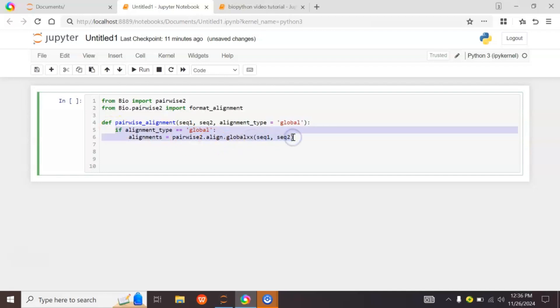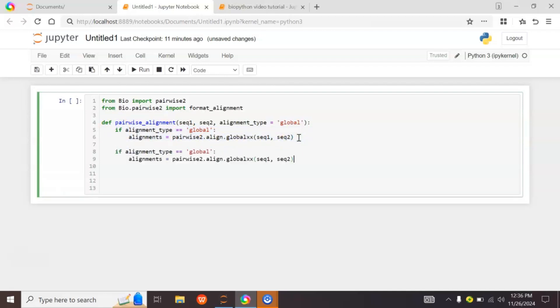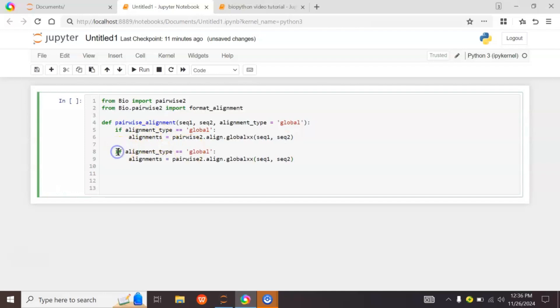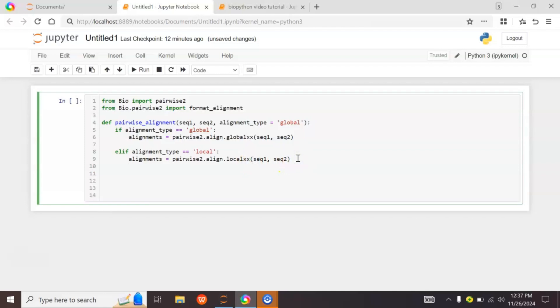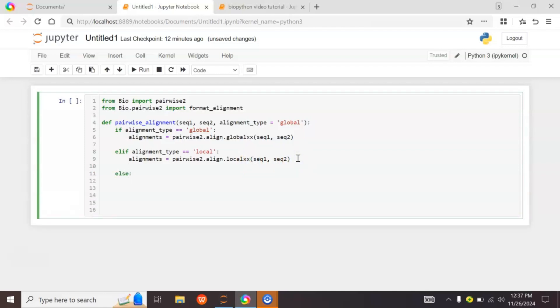If the user provides local as the alignment type, we change the function to pairwise2.align.localxx. Otherwise, if the user provides an unrecognized alignment type, we raise a ValueError and print 'invalid alignment type'.